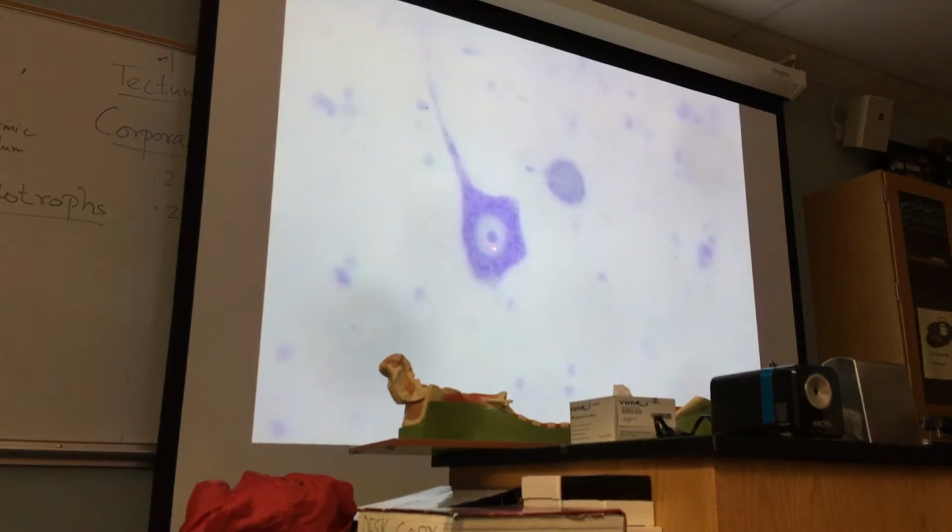You know this is the nucleus, isn't it? But has it been stained? No. So this is negative staining for the nucleus, because DNA is not stained by this preparation, only the RNA. So here you know that the nucleolus is made of RNA and protein.